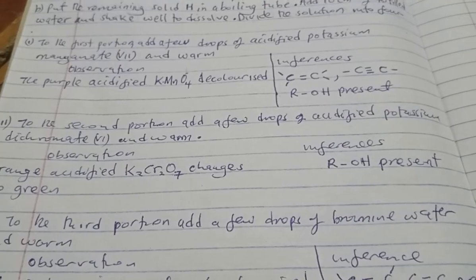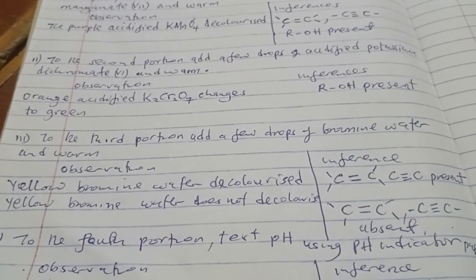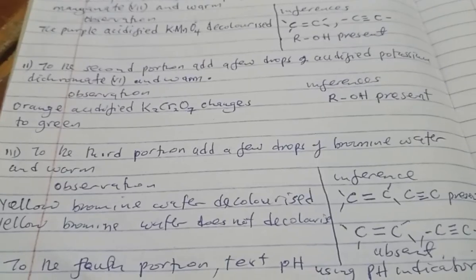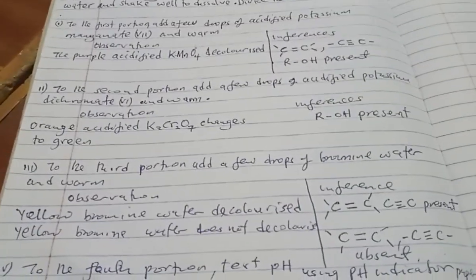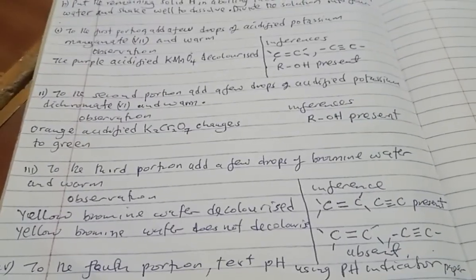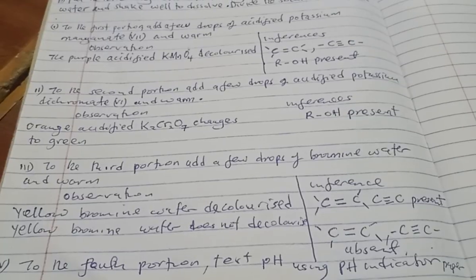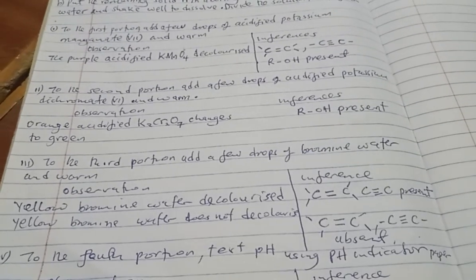Then to the third portion, you are testing with bromine water. Maybe you warm this, sometimes you warm them so that the observation is clear. The examiner will always tell you what you need to do. If they tell you to warm, you warm. If there's no warming, then you leave it that way.